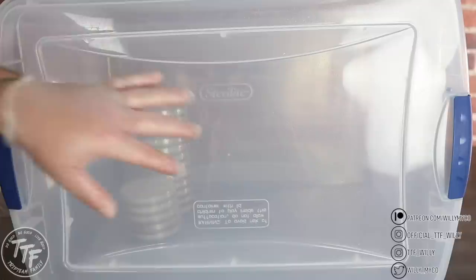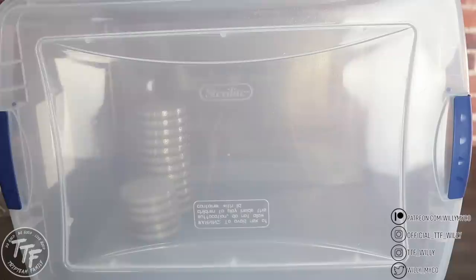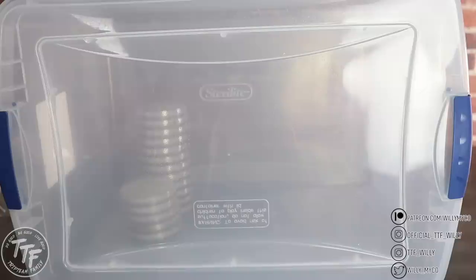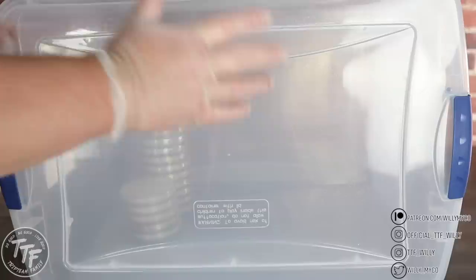This is a nice compromise between a still air box and an open pour, giving you much higher efficiency than just doing open pours on your kitchen counter, while also giving you that still air box benefit. If you do this properly you'll have a perfect success rate every single time — it all comes down to sterile technique. Make sure you're wiping everything down before placing it inside your bin, wear gloves with hand sanitizer, and try to do your pours as quickly and as efficiently as possible. The longer it takes, the higher the chance of something falling onto the agar dishes. The quicker you can pour and get it closed, the more success you'll have.